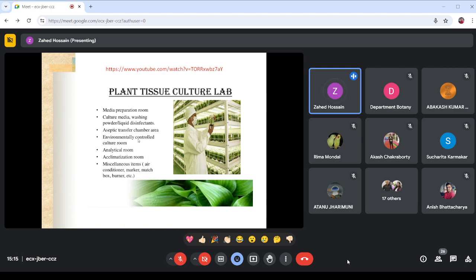And here you can find on the upside of the rack there are fluorescent tubes, which basically maintain the photoperiod. There are certain timers installed which basically regulate the circuit. So it is usually 16 hours light, 8 hours dark, which basically mimics the photoperiod. The humidity should be maintained at 50 to 60%.